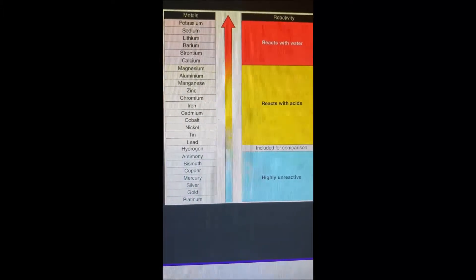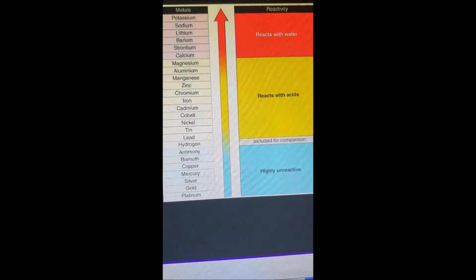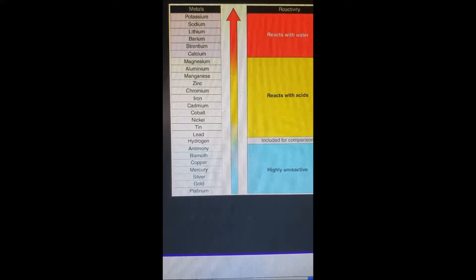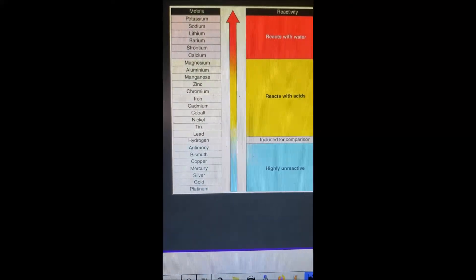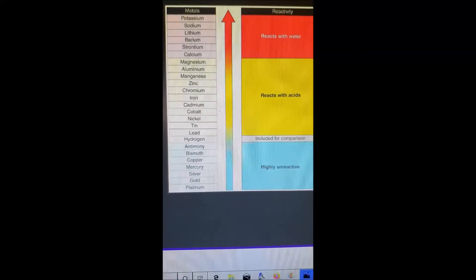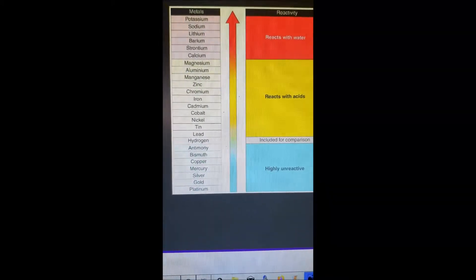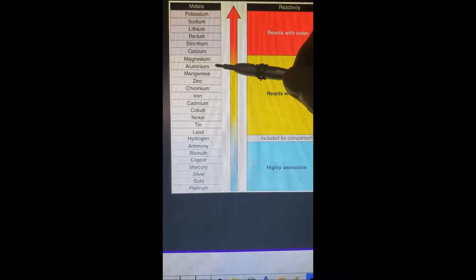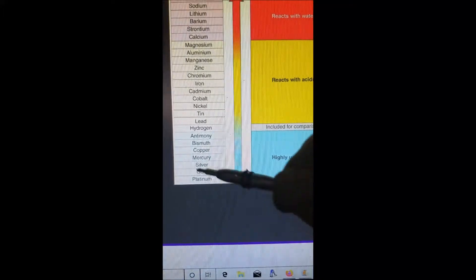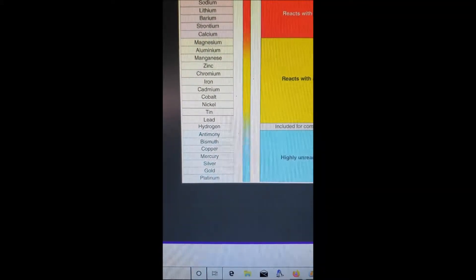So I'm starting again. What I'm going to do is put aluminium in my solution. I've got tonnes of aluminium from pulling computers apart. The cases around the CD drive are nice — they're not paper thin but not too thick, a good thickness to throw in acids. I've got bucket loads of it collected. So I'm going to put the aluminium in, and then everything below that, whatever's in the solution, will fall out.